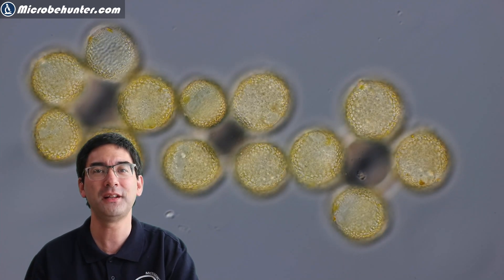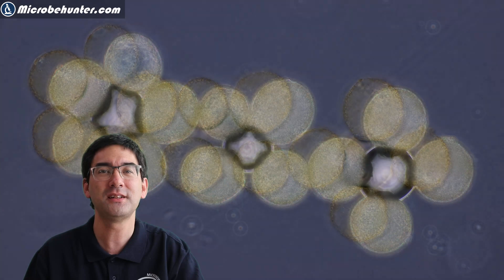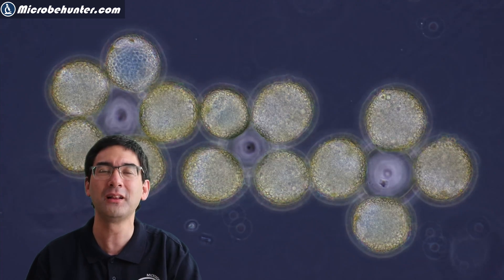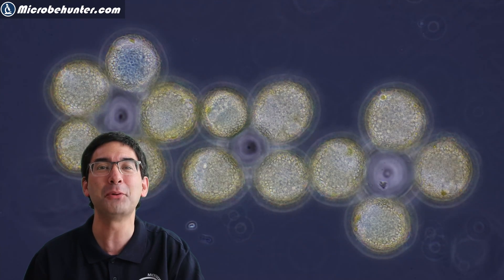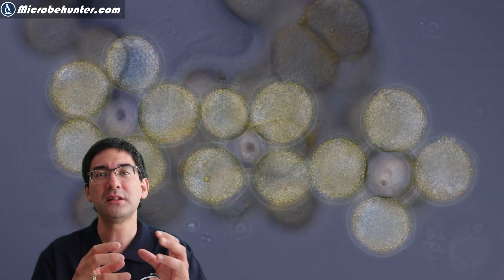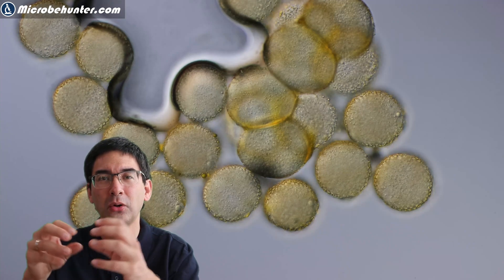Some pollen started to accumulate and cluster around air bubbles. By focusing through the pollen you can see a little bit of the surface texture, which I find quite fascinating. You can play around with different lighting techniques — I tried phase contrast as well as bright field. Those pollen are spread from flower to flower, and when they pollinate the stigma, a pollen tube grows.